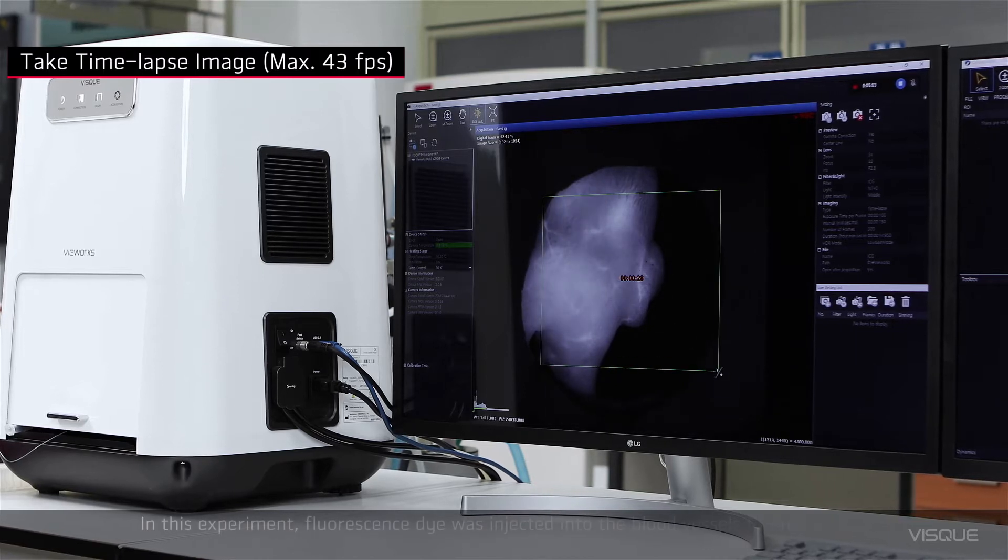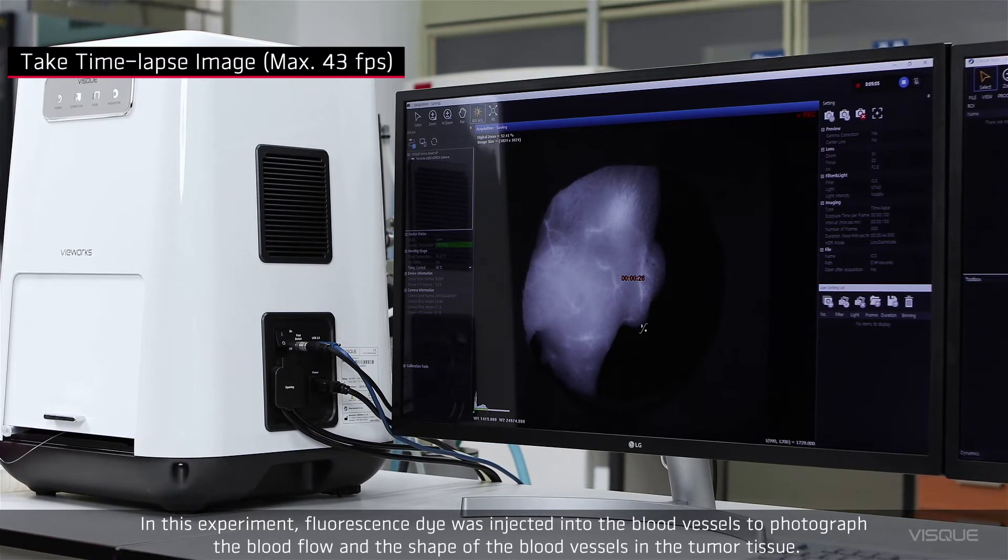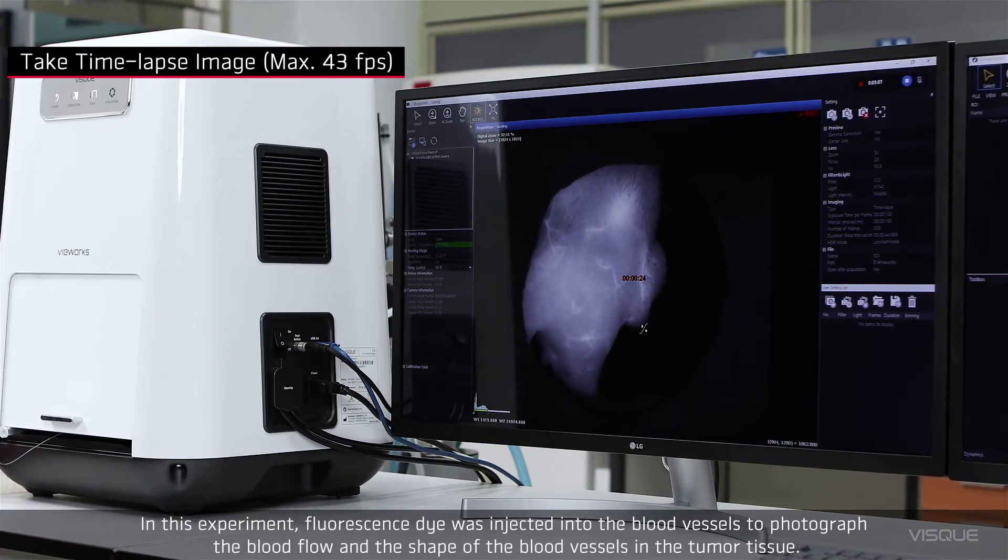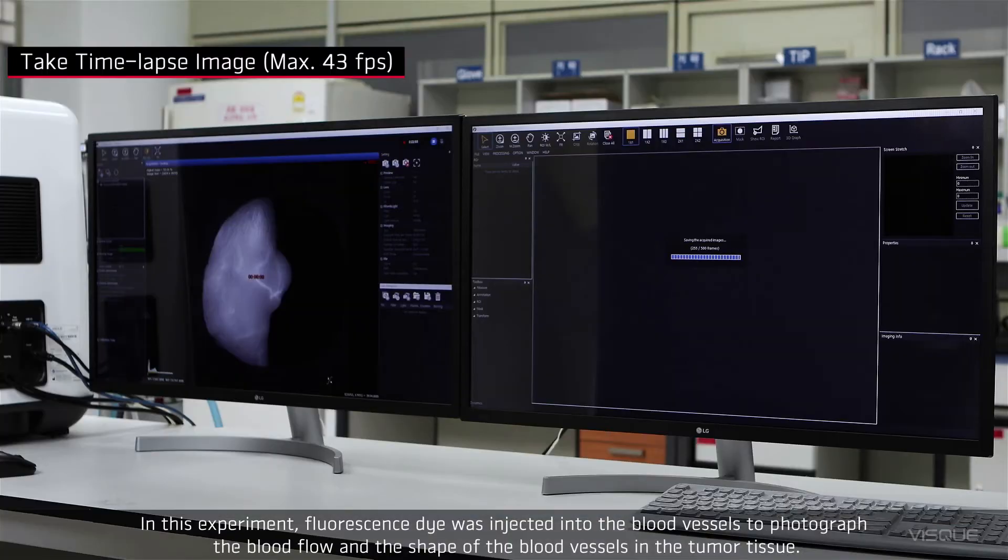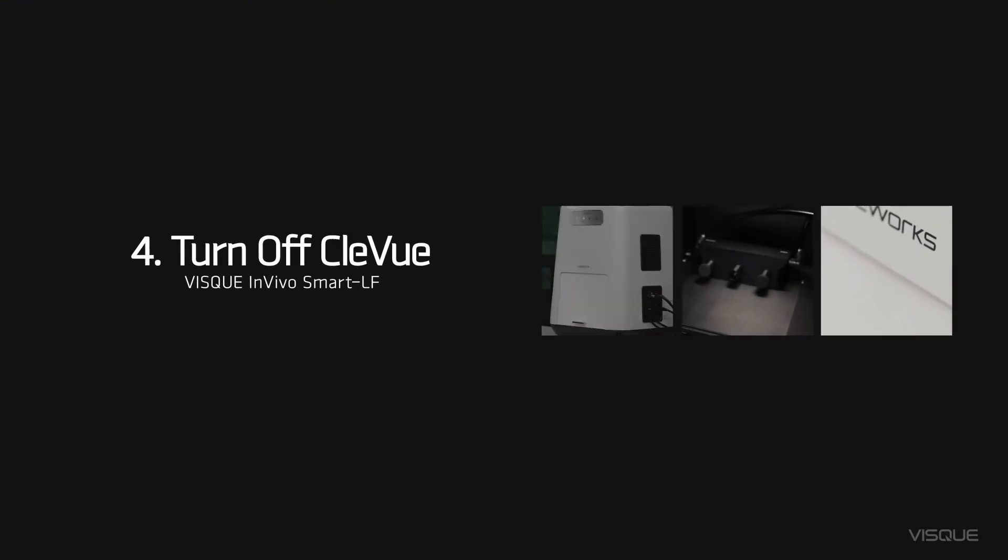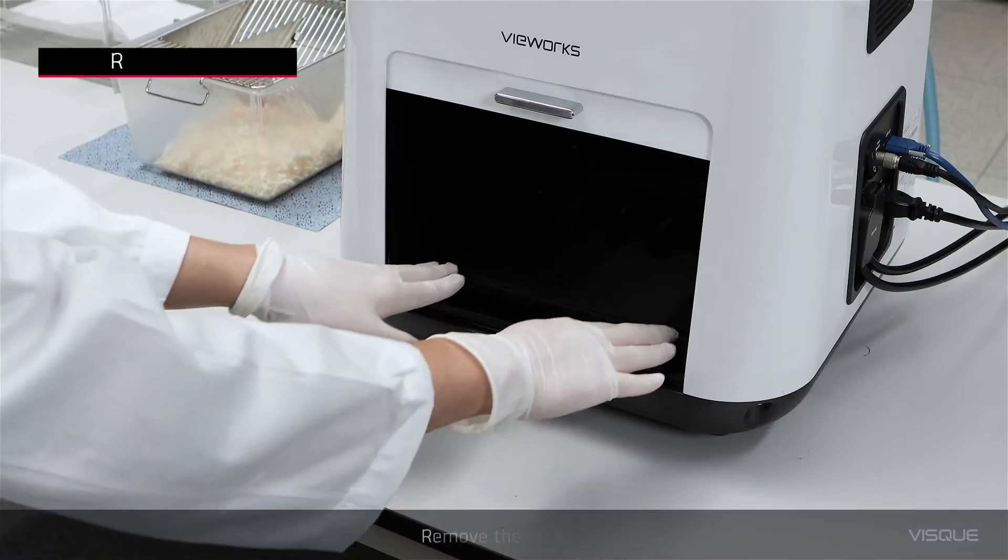In this experiment, fluorescence dye was injected into blood vessels to photograph the blood flow and the shape of the blood vessels into tumor tissue. Remove the mouse.